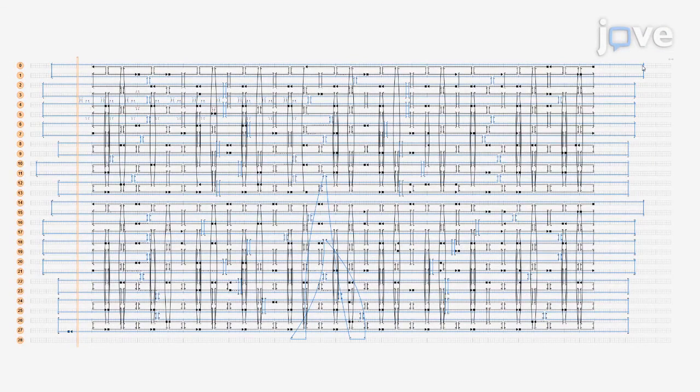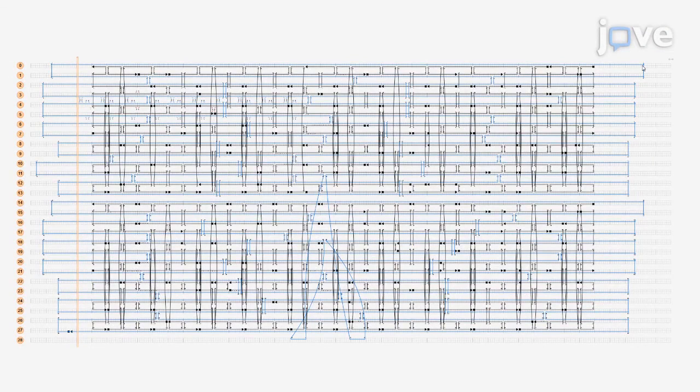Use CAD-nano to design a DNA origami template. Route the scaffold and staple strands according to the desired shape of the template. Then generate the staple strand sequences by clicking sequence tool.